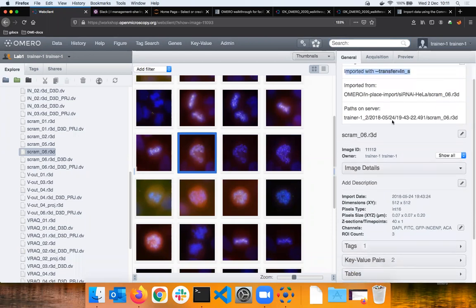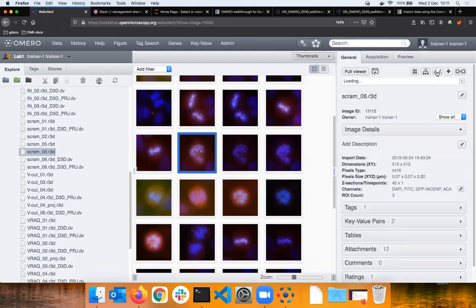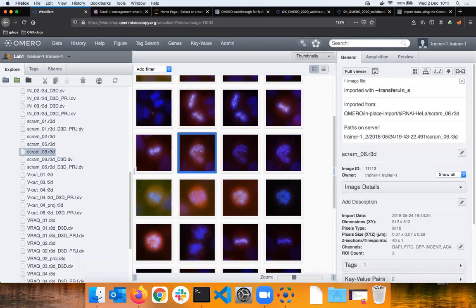No, that is the answer to Sylvie's question. As long as the volume where the data live is mounted, the server that OMERO is sitting on and the one where the data are sitting can be different servers. It's a bit like when you put your USB key in your computer and you can open an attachment. It's the same paradigm. Actually, I can show that to you.